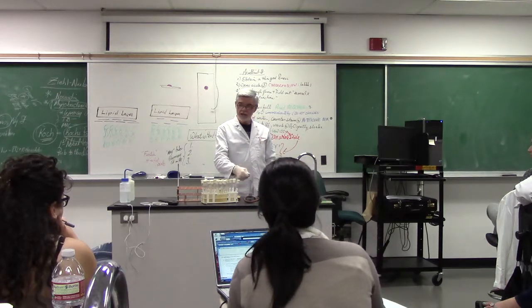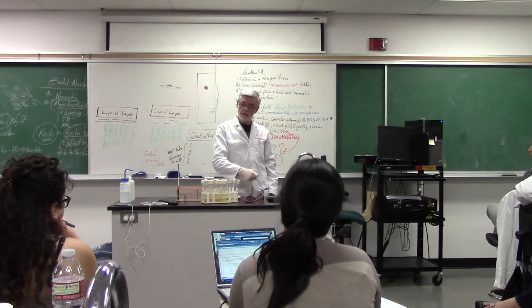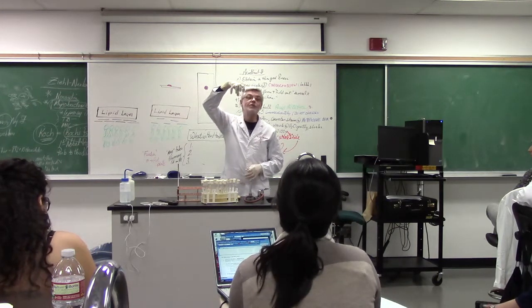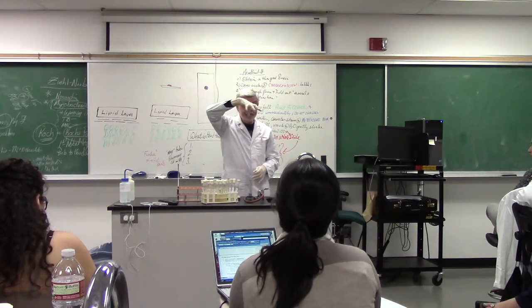So, put it in, hold it out, put it in, hold it out, put it in, hold it out. How long? Until that bubble shrinks. Until it begins retracting. Not until it's dry. Until it just begins retracting.